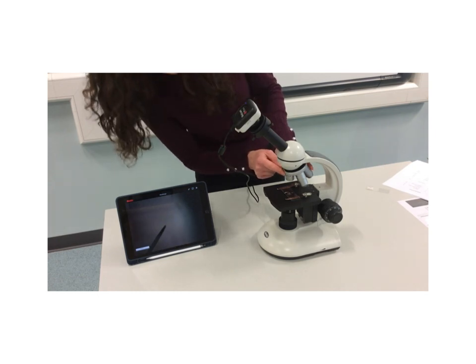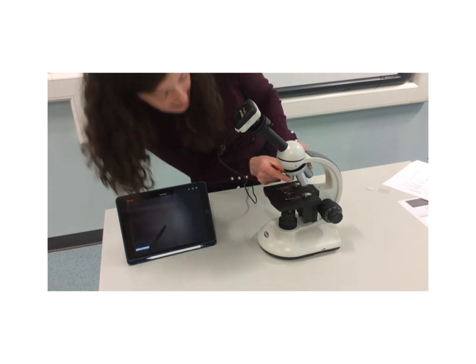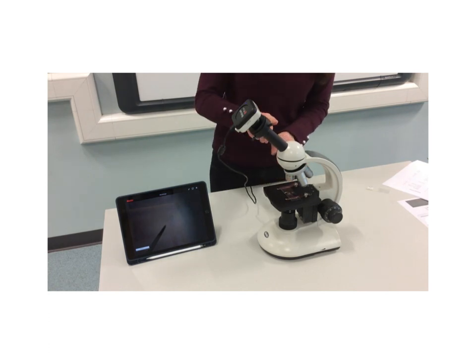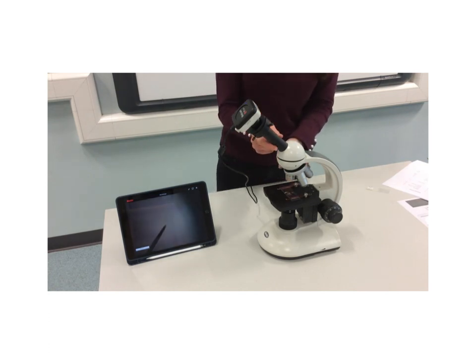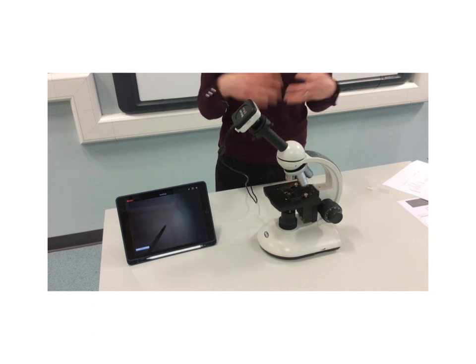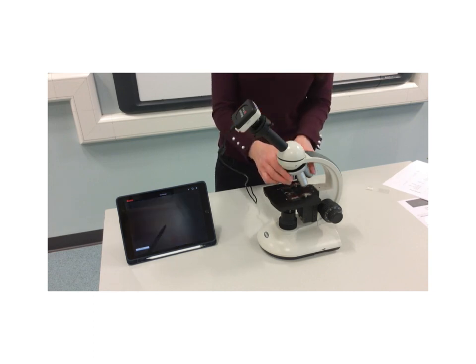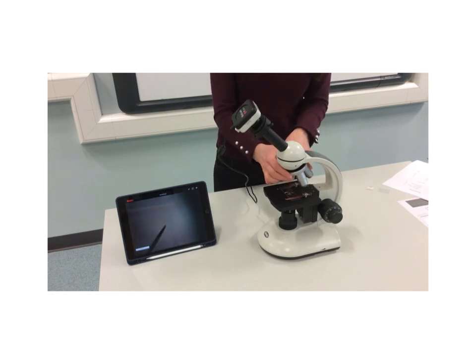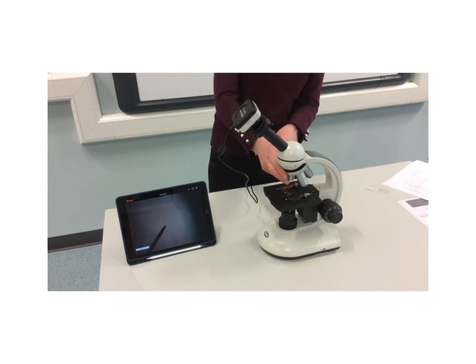This is the smallest objective lens, and it is, let me have a quick look, it's times by 4. So if the eyepiece lens multiplies it by 10 and the objective lens multiplies it by 4, that's a total magnification of times by 40. Remember, we multiply the 2 magnifications together to get the total magnification. So times by 10 times by 4 gives us times by 40.